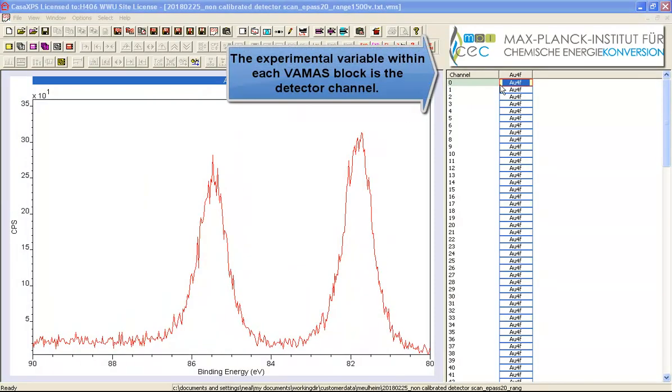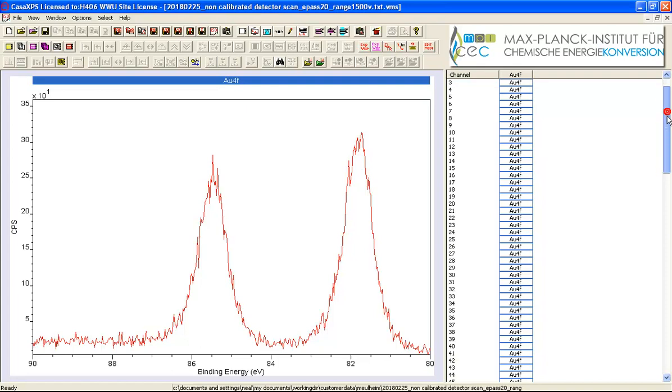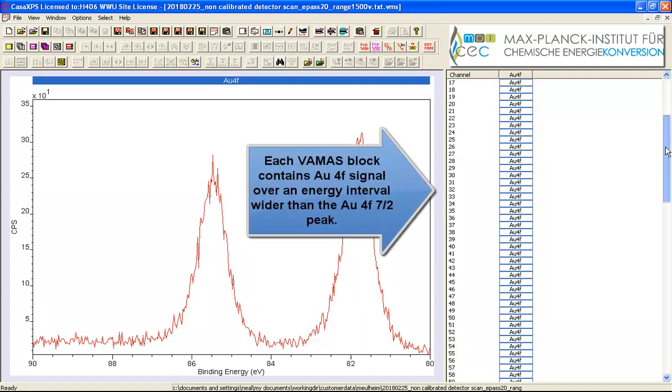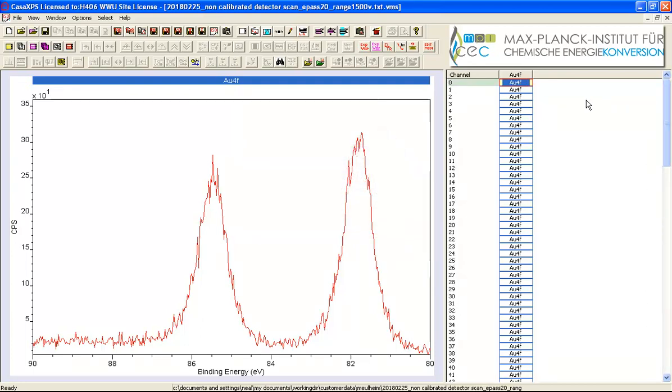These spectra are from a gold sample and they have been recorded in such a way that rather than having a single spectrum, which is the normal method, the data have been separated into 140 different spectra.